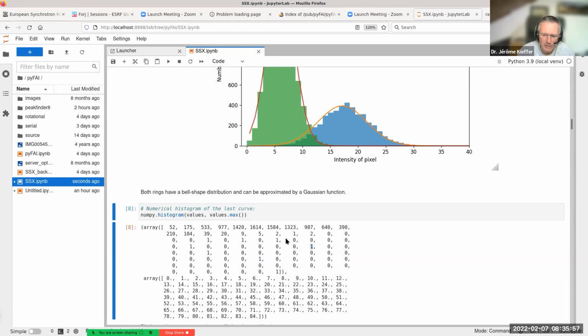And yeah, well, let's say anything above this, those are all outliers, or maybe even from here. All those pixels are probably outliers. And those pixels are probably Bragg peaks. There is some contribution from a Bragg peak.